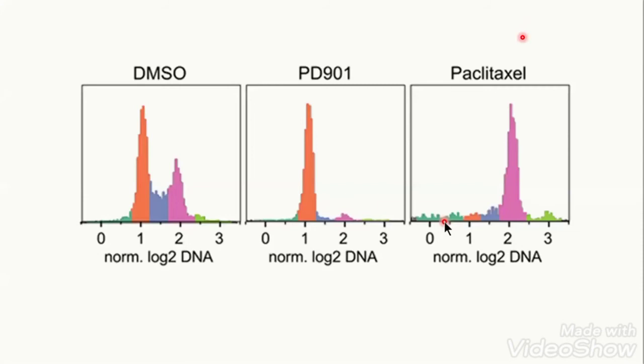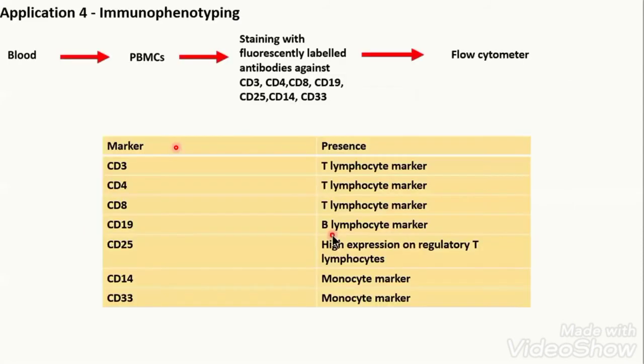So let's go for a little bit more complex application, that is immunophenotyping. Now I want to analyze, within a given blood sample, how many are T cells, how many are B cells, how many are macrophages, how many are monocytes.